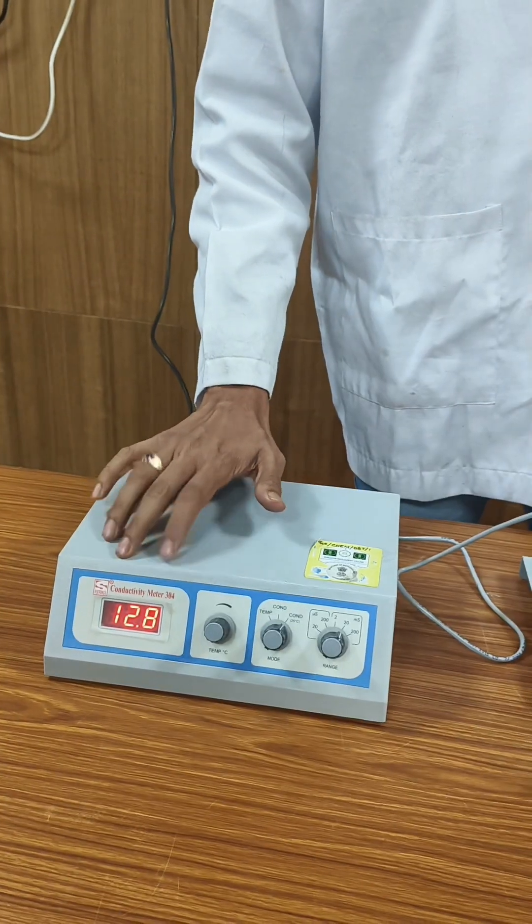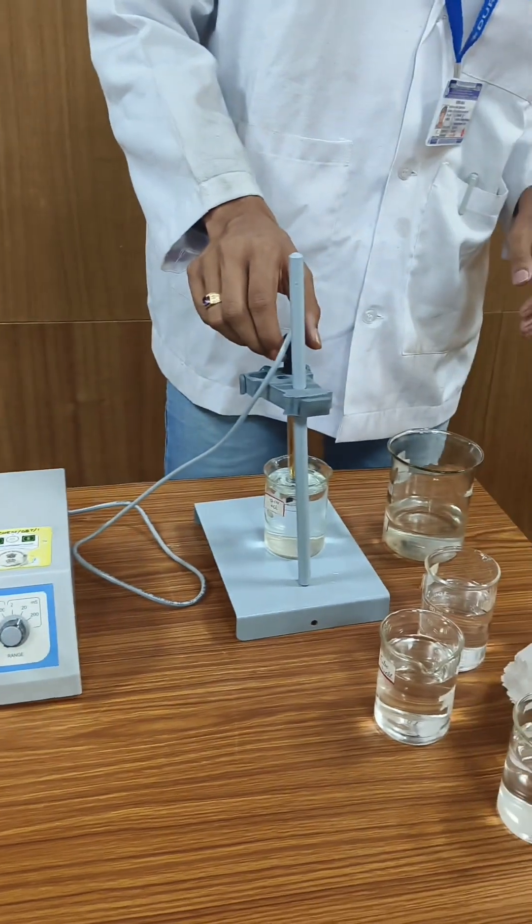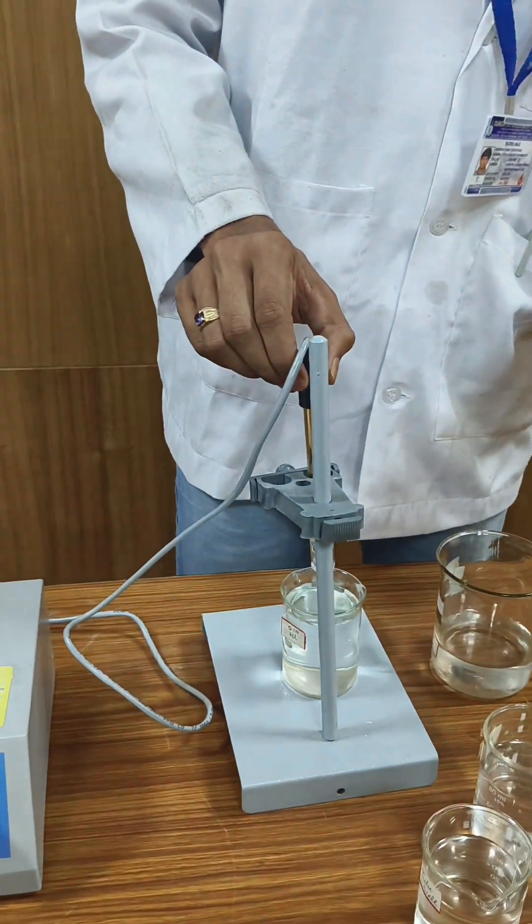Now we set the conductivity value and remove the electrode from the KCl solution.